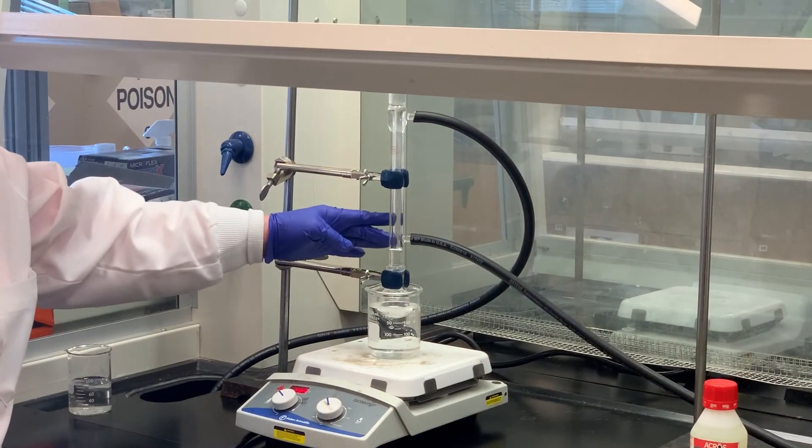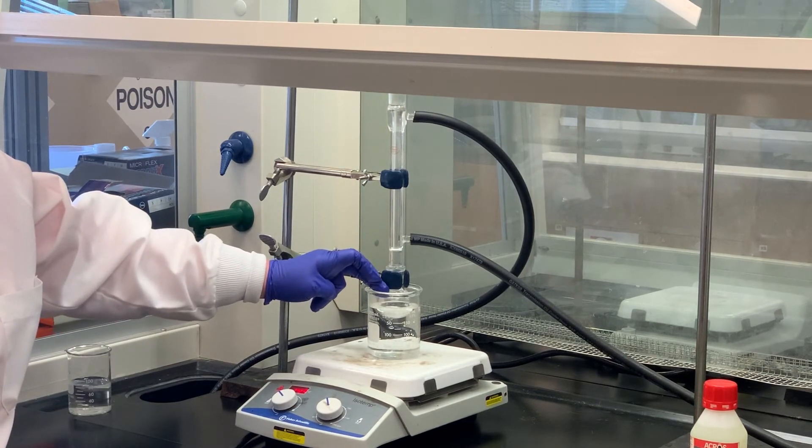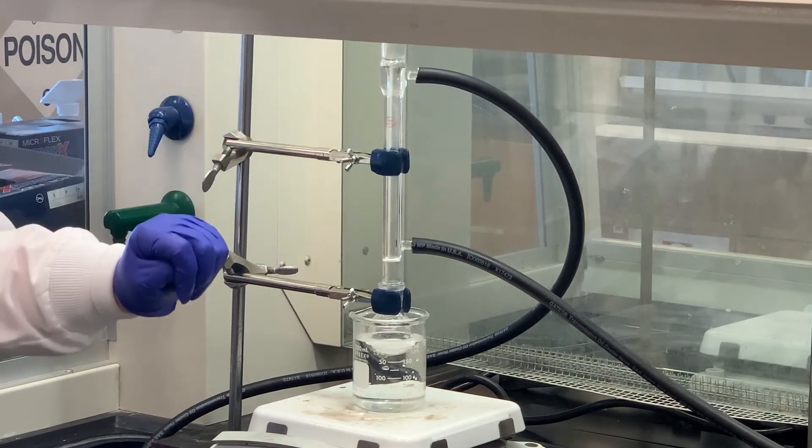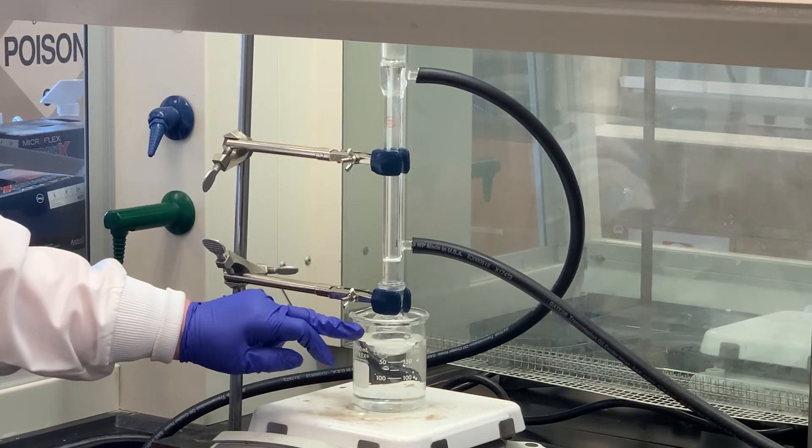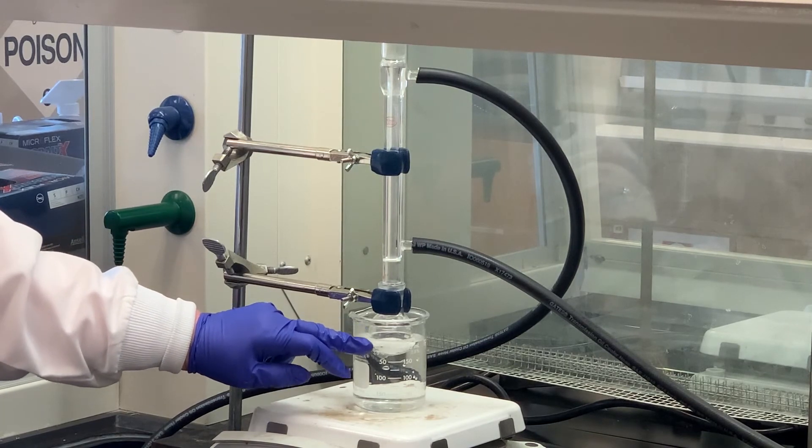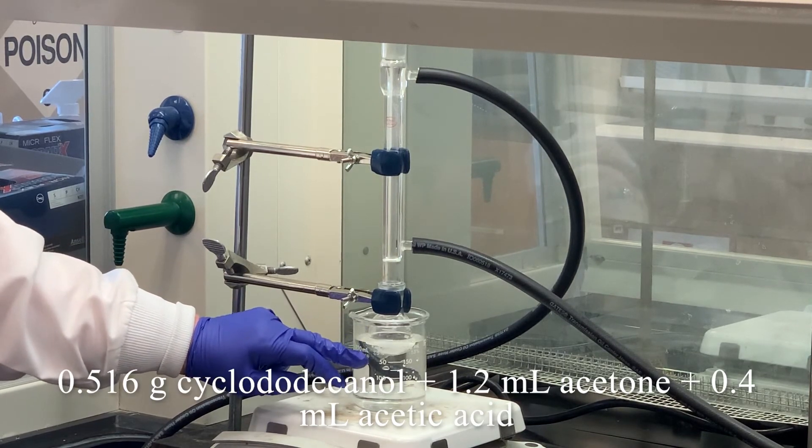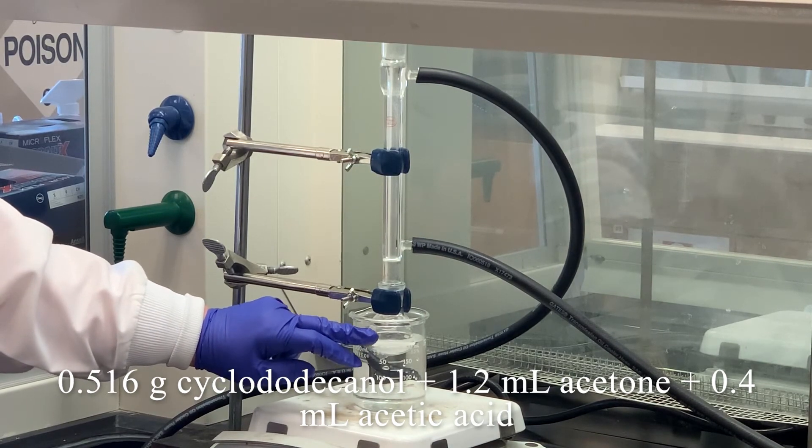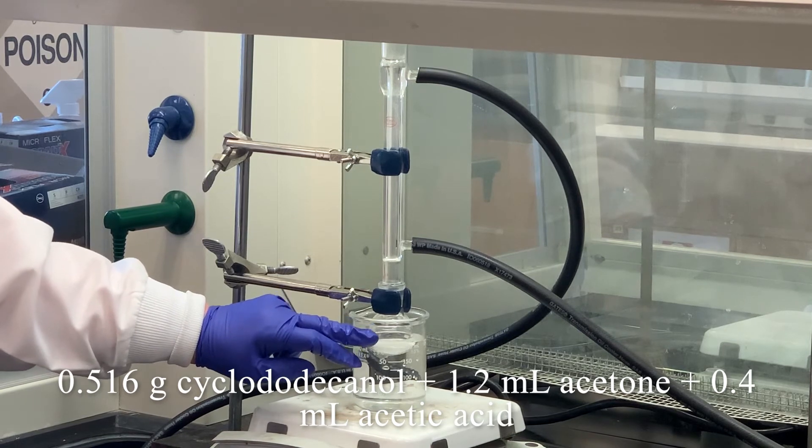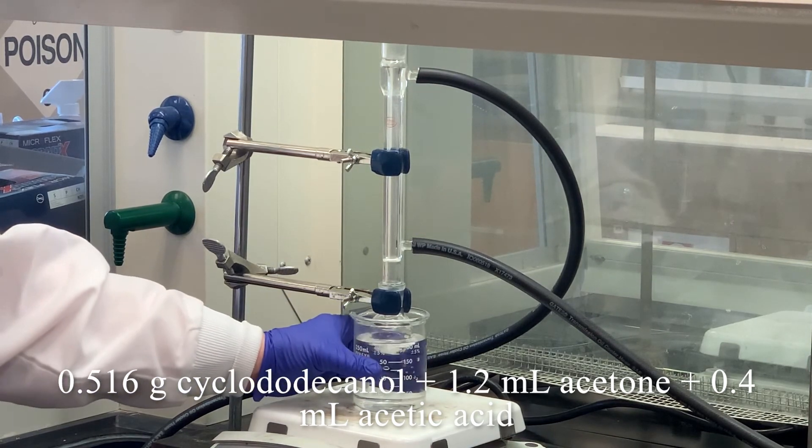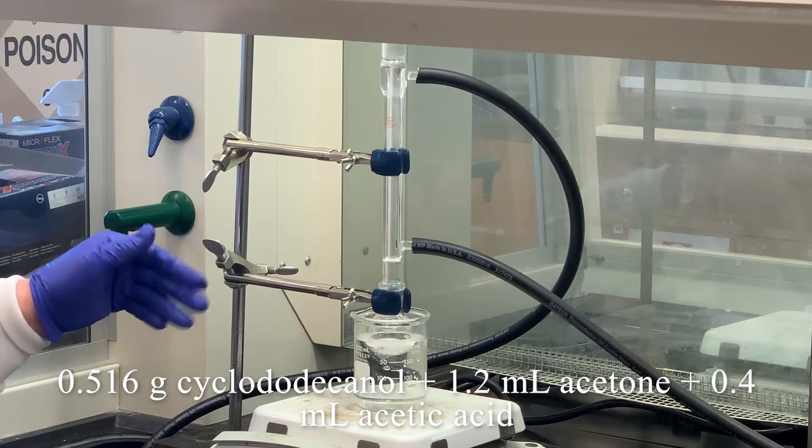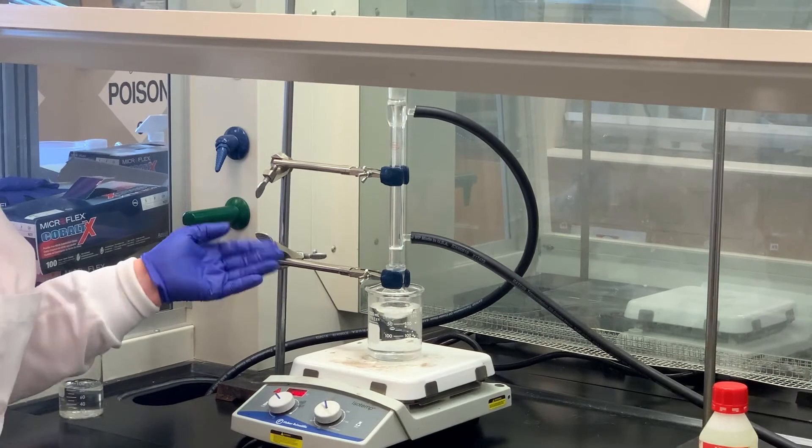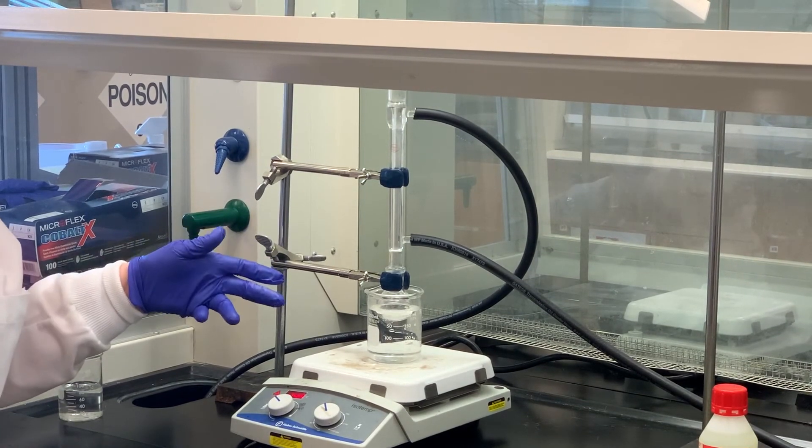I have the apparatus set up. We've got the 25-milliliter round bottom flask hooked up through the condenser, water going through the condenser in the bottom, out the top, and a stir bar stirring the components inside the flask. What I have in there is 0.516 grams of our alcohol, the cyclododecanol, 1.2 mils of acetone and 0.4 mils of acetic acid. We need to heat the contents to about 45 degrees Celsius. Once we're at 45 degrees, we'll start adding the bleach—we'll add about 4.5 mils over a 30-minute period.